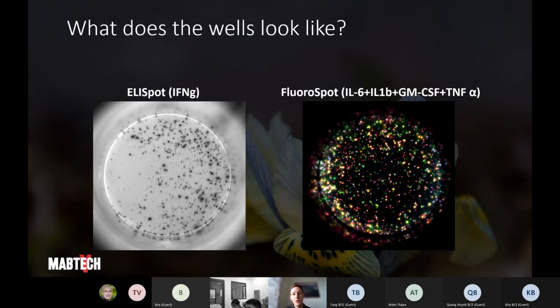And then the researchers will also, of course, have their own stimulation conditions. If you think about COVID-19 research, they will take something that is a part of the COVID-19 virus, a footprint, and add it into the well and let the cells react to that stimulation.